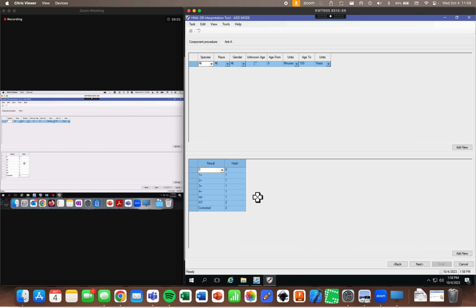This little table of hashes, I'm going to reuse for my other DTAs because they all use the same alphas. And so I might as well just use the same hash patterns. If I want to, I can copy this little table, but there is a specific way that we have to use that copy functionality.